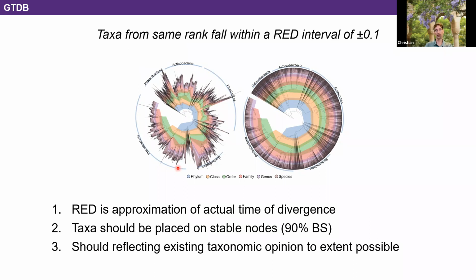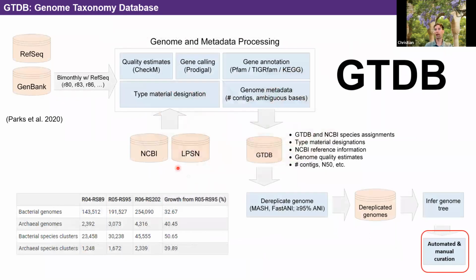Okay, since we know this, let's look at the GTDB again, and that is another way of showing the workflow, but I just want to focus on this one. So once we have our species defined based on ANI, then we de-replicate that. We only need one representative per species. That's really to reduce the number of taxa we have, because next we infer phylogenomic trees. Those are based on single copy marker genes, 120 for the bacteria, and originally 122 for the archaea. We now recently switched that to 53, with a multiple sequence alignment of concatenated marker genes.